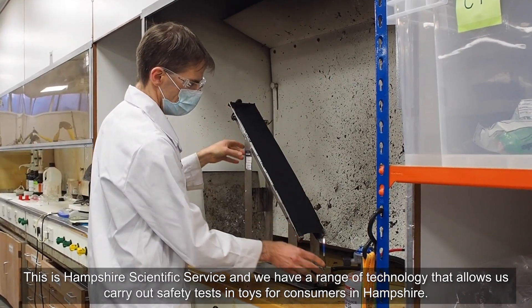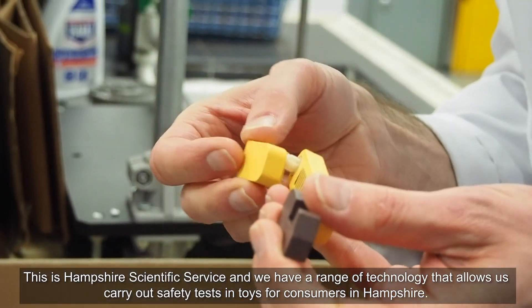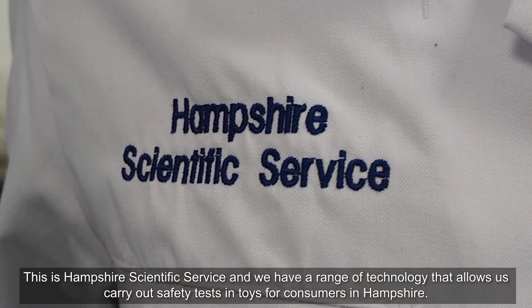This is Hampshire Scientific Service and we have a range of technology that allows us to carry out safety tests on toys for consumers in Hampshire.